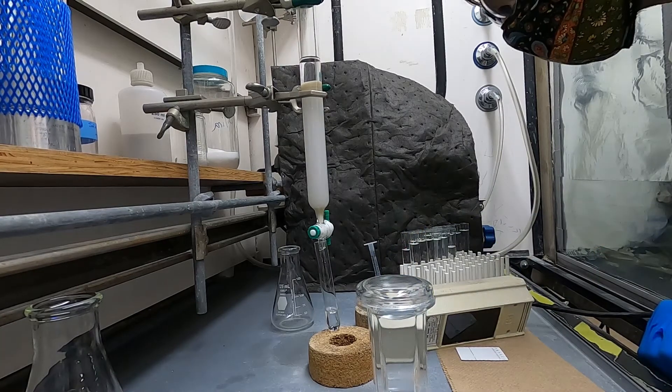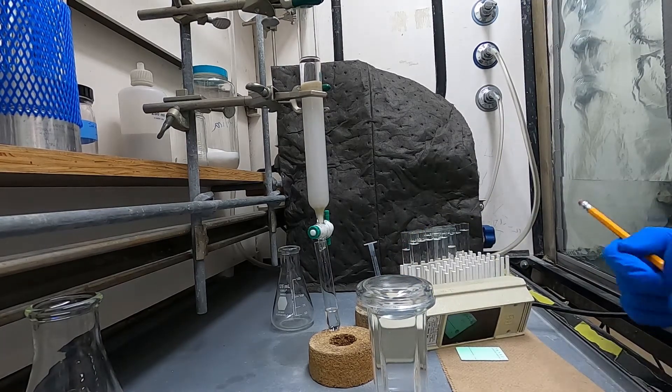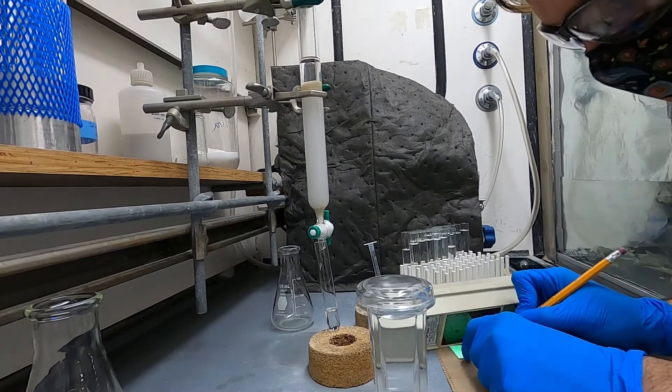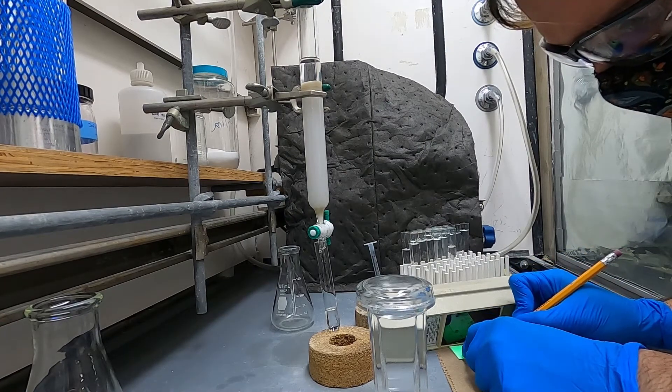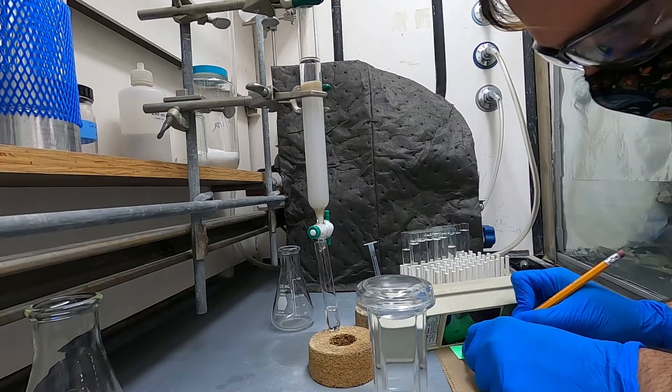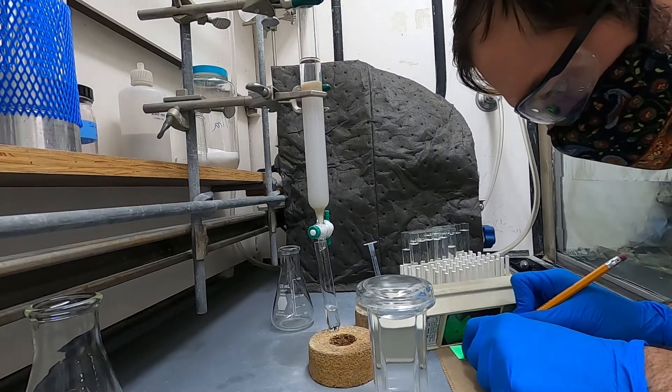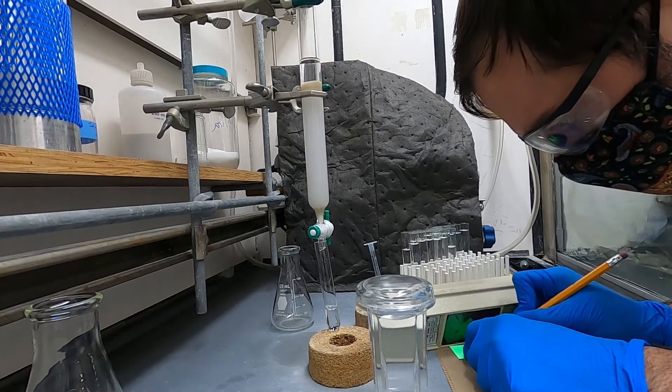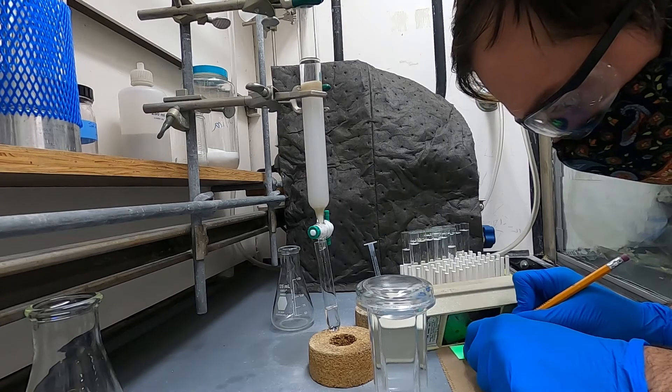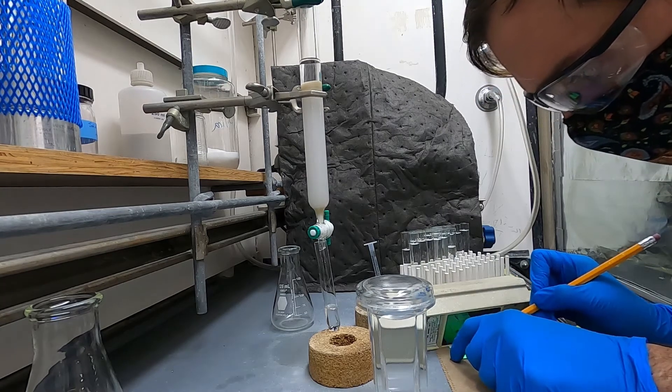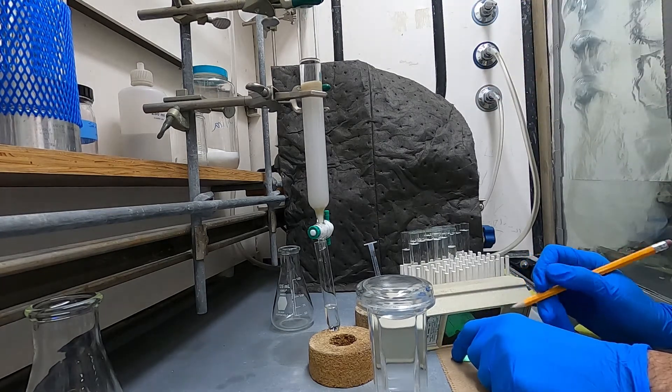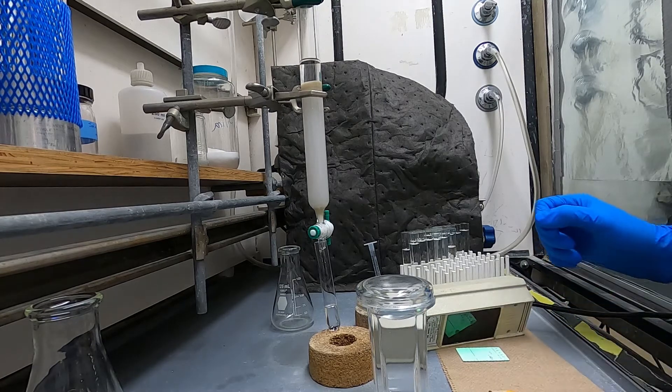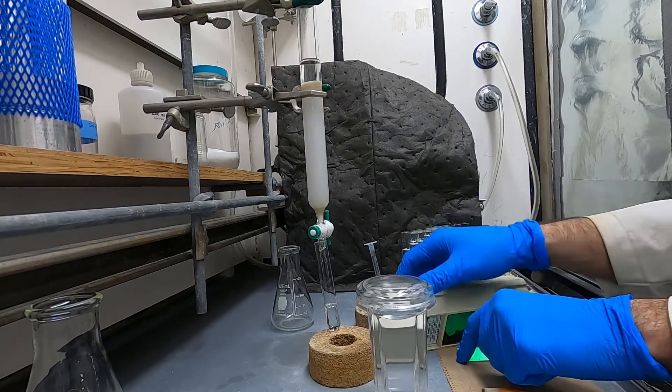Once you've got your TLC plate spotted and developed you will visualize it. Most things if you have a UV handle it's really easy to just visualize by UV. Sometimes you'll need to use a specialized stain that we have in every lab so just figure out what's appropriate for the thing you're trying to isolate and use that visualization method appropriately.